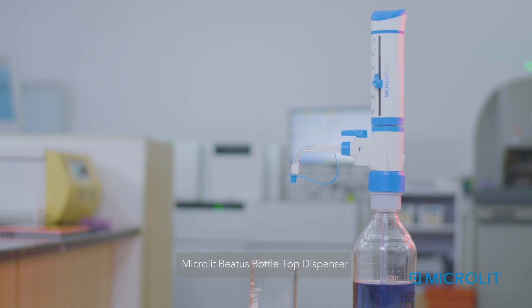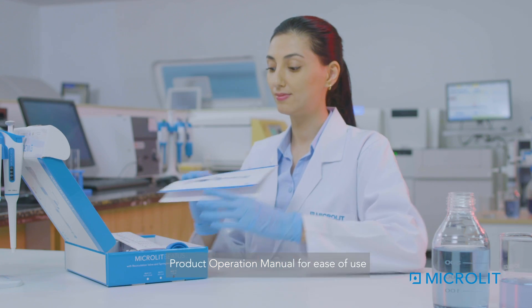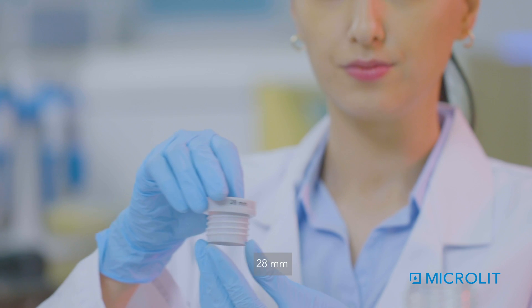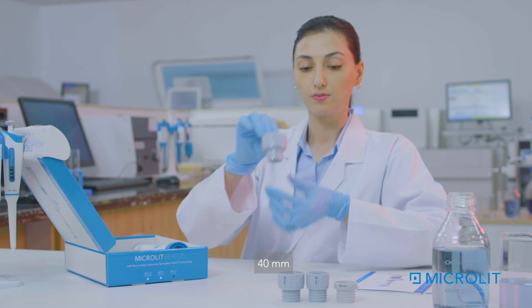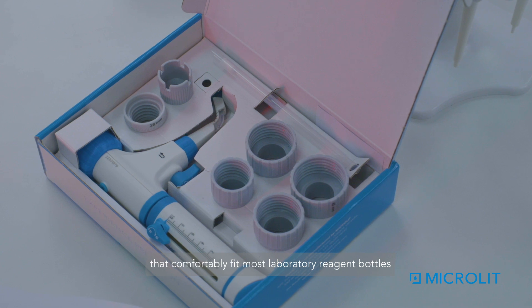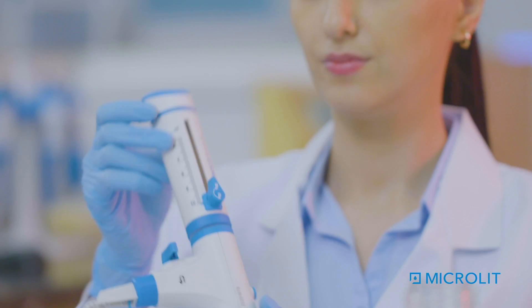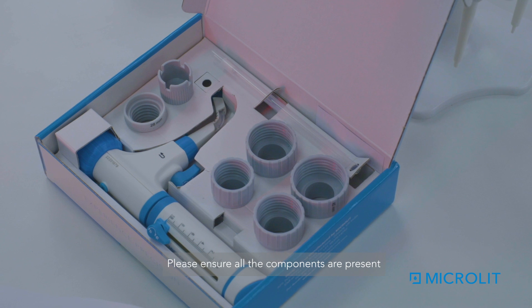Microlit Betis Bottle Top Dispenser comes with the following accessories: Product Operation Manual for ease of use; Calibration Report or Certificate; five bottle adapters — 28mm, 32mm, 38mm, 40mm, and 45mm — that comfortably fit most laboratory reagent bottles; a Telescopic Inlet Tube that can be adjusted in length according to a variety of bottle sizes; and a Calibration Tool to calibrate the dispenser when needed. Please ensure all the components are present upon opening a new dispenser.